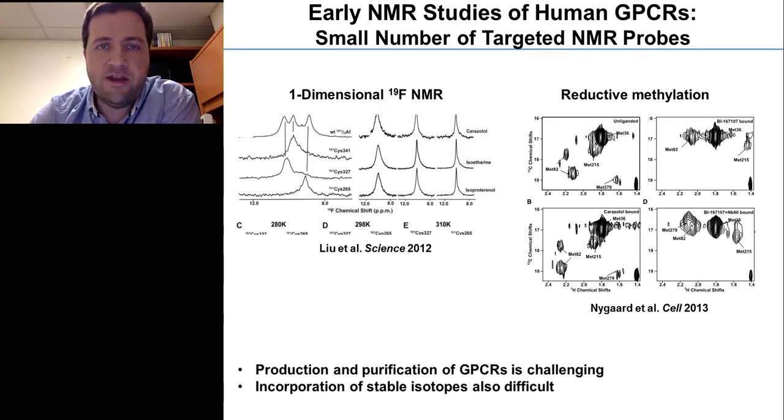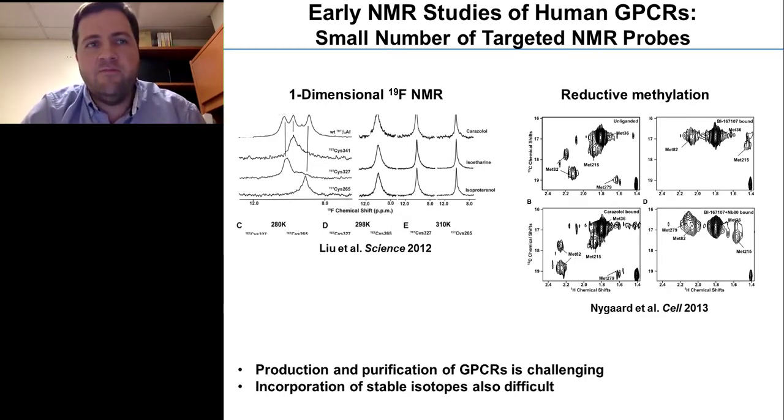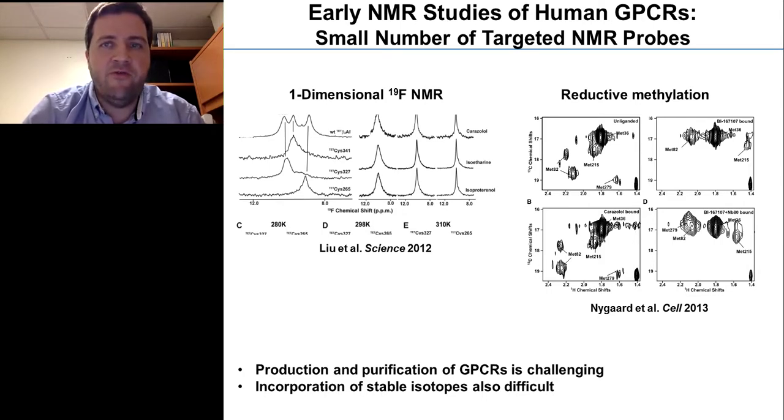On the right, there was a technique using reductive methylation that was first published in its relevancy to studying human GPCRs by the Kobilka group. And this is an example of the kind of data that was obtained with this method. Lysines could be methylated with a carbon-13 CH3 group and thereby studied with NMR spectroscopy. So what these studies had in common is that they typically introduce isotopic labels, which are necessary for NMR spectroscopy, as a kind of post-translational modification.